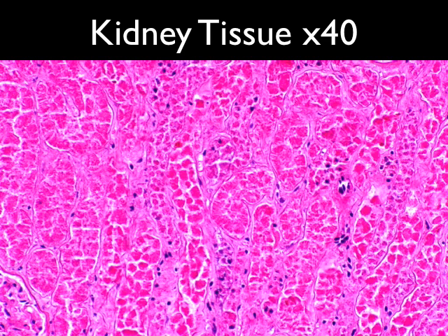Why is there a different shape? Could be different muscle, good idea, but not in this case, no.